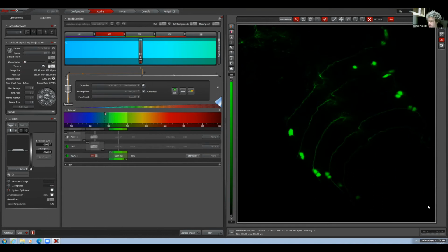Okay, cool. And it's the same. The double neurons. There's like two of them for each of these. It's a rib cage, which are the projections, but then you can see one neuron, two neuron, one neuron, two neuron. Yep. Cool.